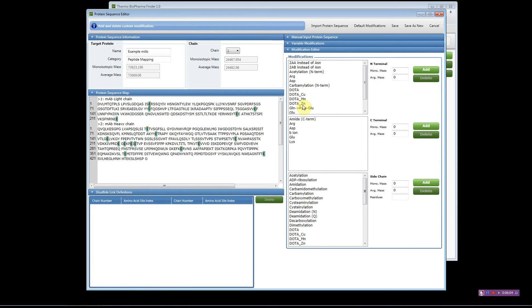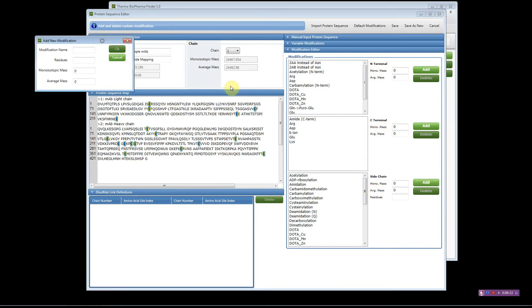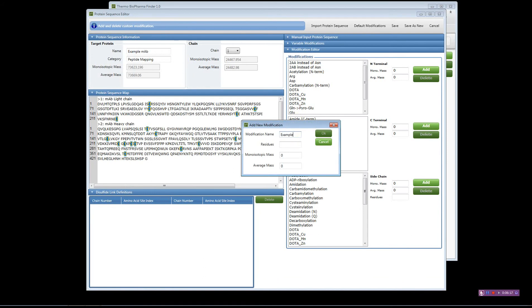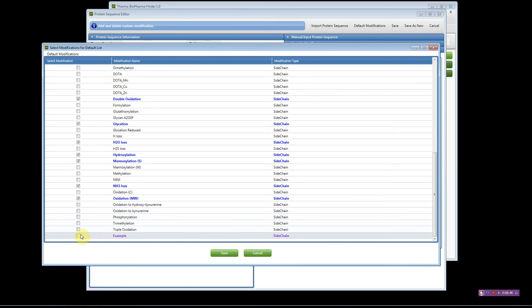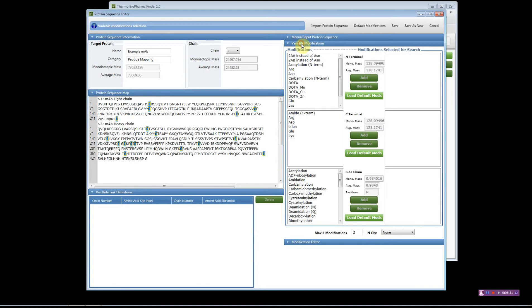To add a custom modification, click Modification Editor. It is broken up by N-terminal, C-terminal, or sidechain. You can name the modification, pick the specific residue, and add in the mass — the monoisotopic mass and the average mass — then hit OK. A custom modification will show up in purple and can also be assigned to your default modification list, making it quick to reload in future sessions.